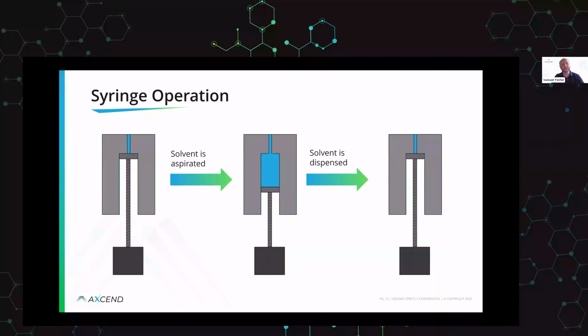And so really the question then is, why don't I just use a giant syringe, right? If I'm not capable of generating continual flow, but I'm running at 1 microliter a minute, why don't I take a 500 milliliter syringe and then it's effectively the same as continual flow because I can run it forever? The answer is you can't.